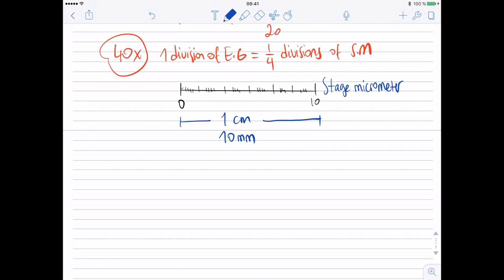The real length of the stage micrometer is ten millimeters. How many divisions are there in the stage micrometer? 100 divisions. So 100 divisions of stage micrometer equals ten millimeters. Millimeter is not a preferred unit to work at microscopic level, so let me convert it to micrometers. Remember the conversion from millimeter to micrometer — multiply by one thousand.